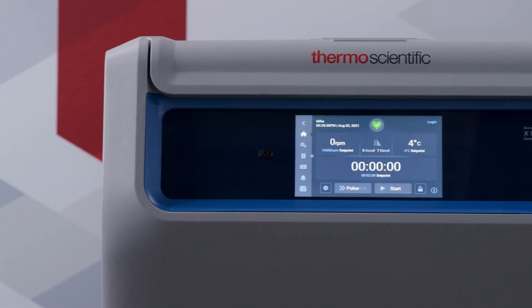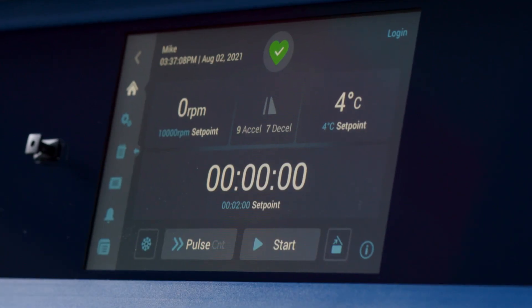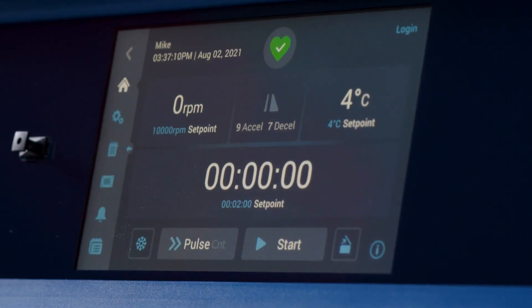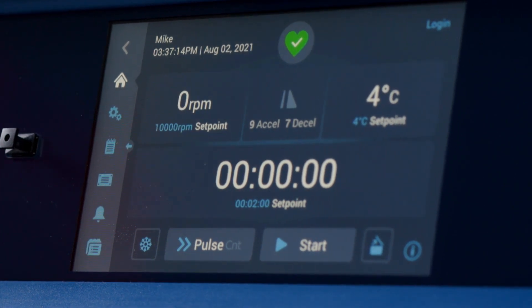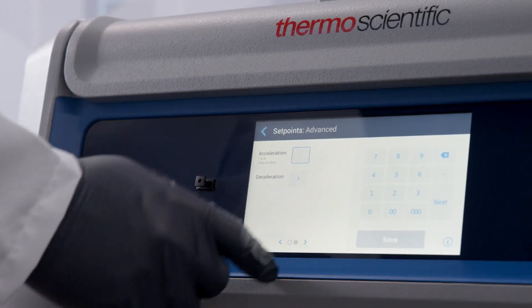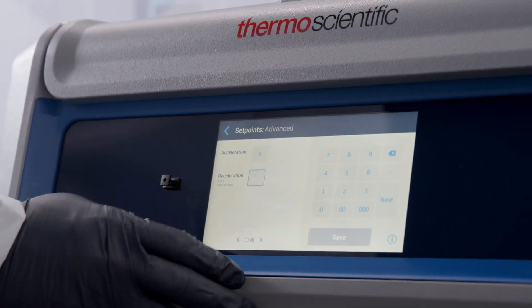Optimize your project with the Thermo Scientific General Purpose X-Pro Centrifuge series. This hybrid benchtop centrifuge provides maximum sample security and reproducibility in an intuitive, easy-to-use platform. The X-Pro Centrifuge has a graphic user interface with a few standout functions that we would like to demonstrate today.